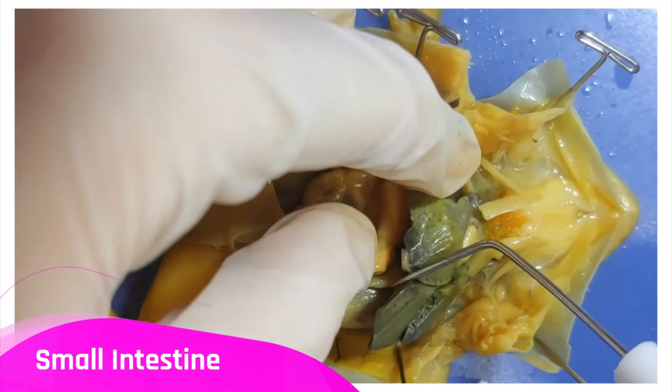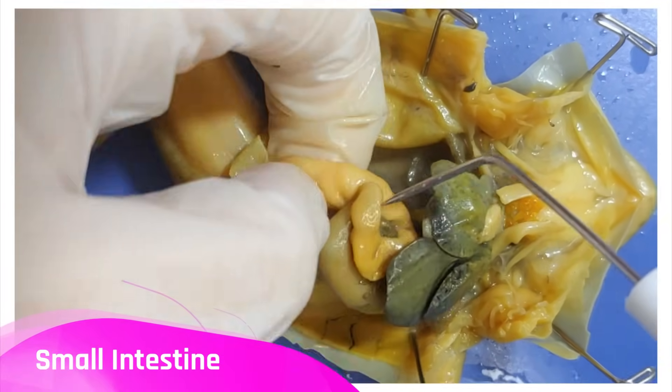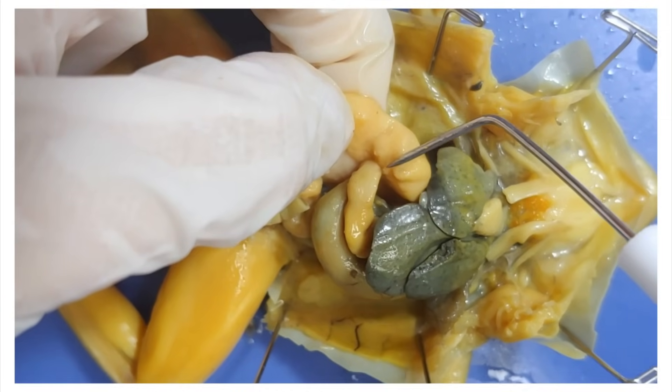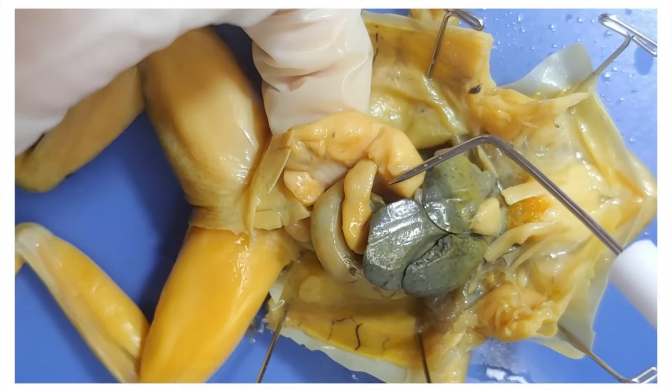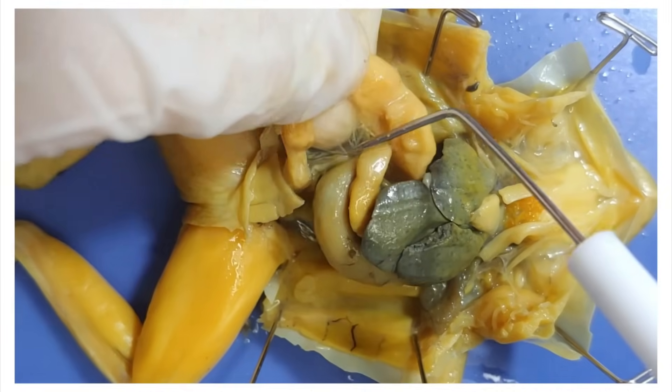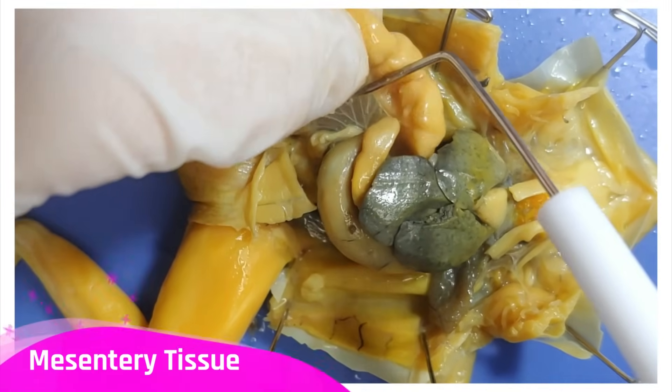Here's the small intestine, which functions in absorbing nutrients from the frog's food. Your intestines don't just sit wherever they want in your body like a pile of noodles — they actually have scaffolding to keep them in place, called the mesentery tissue.